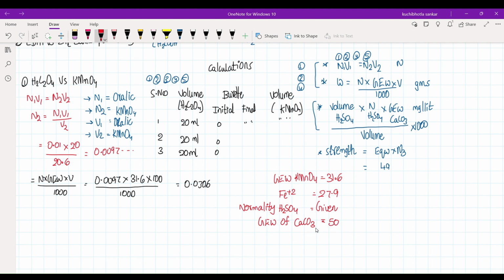And from the 4th experiment, that is the zinc complexometric, the constant that you should be remembering is this thing. Okay, and for the zinc we are here again 32.69.